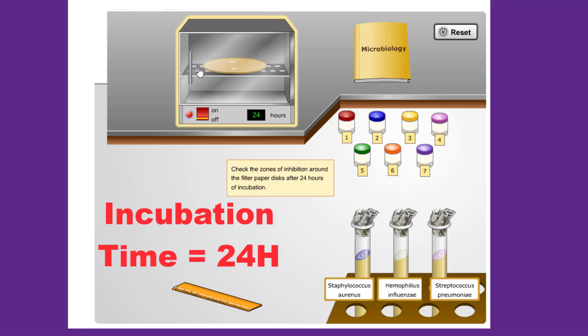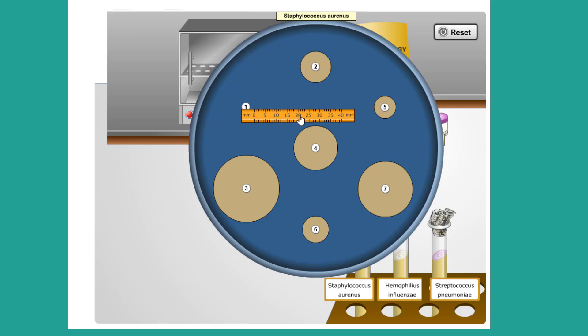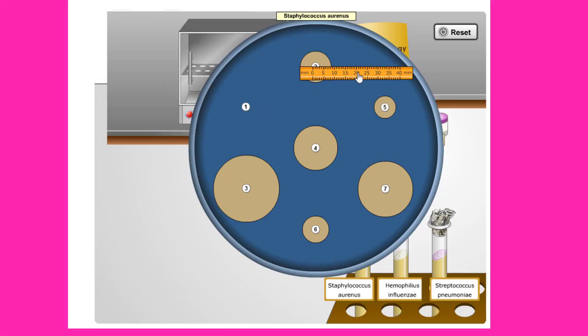We will incubate for 24 hours. We can click again to remove the petri dish from the incubator. Next, we will examine the patterns of bacterial growth. The colored area that covers most of the surface of the petri dish is called the lawn culture of the bacteria. This is the visible layer of thousands of bacterial cells that are growing together.